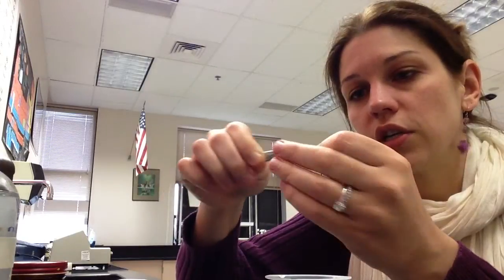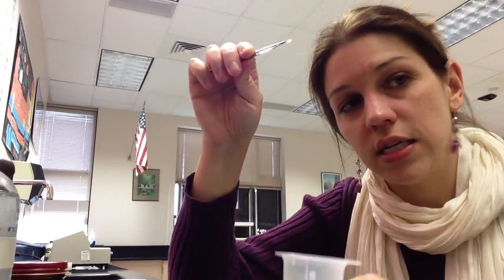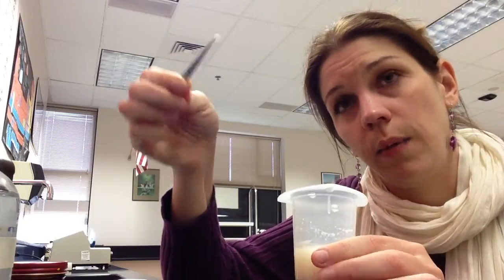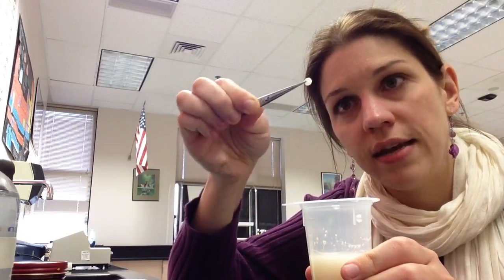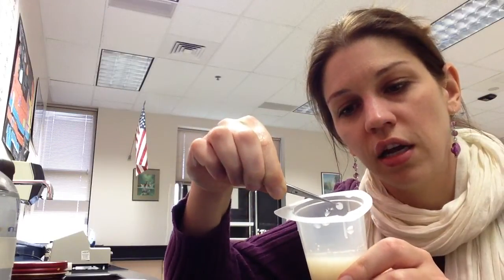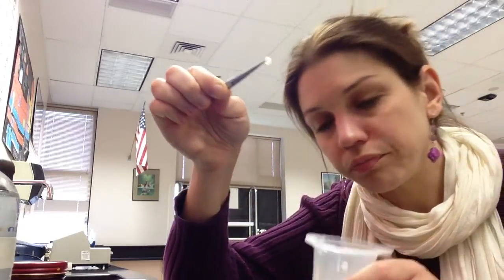So it tells you in your directions to dunk it in the yeast solution for 5 seconds. The whole goal behind that is to make sure that it has enough time to soak the paper through. So give it a 5-second count, and then you pull it out. And now what I like to do is I just touch the disc to the side of the container so that any excess just comes off.